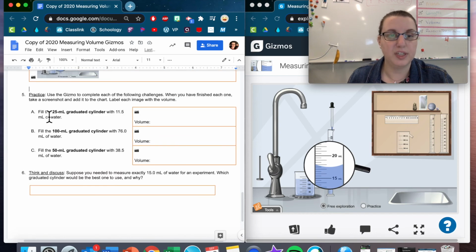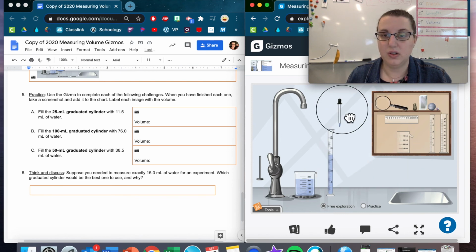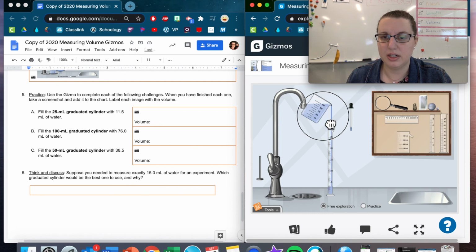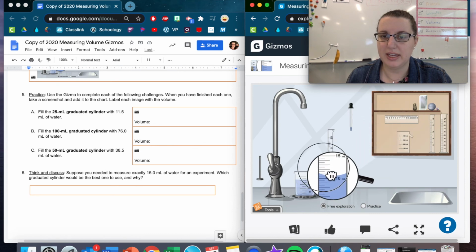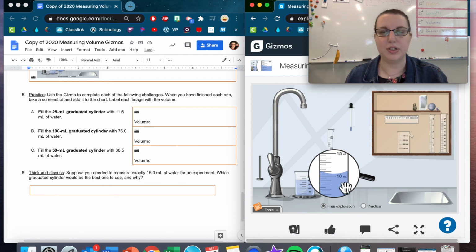All right, so we need to fill the 25 milliliter graduated cylinder with 11.5 milliliters of water. All right, so I'm gonna take this away. So now we have the 25 milliliter graduated cylinder right here, but it's full of too much water. So I'm gonna dump it out, and then I'm gonna try filling it up again here. I'm gonna stop around 10, use my magnifying glass again to take a look. All right, and I've got in here, it's at 10, not at 11, so this is about 10.5-ish right now.